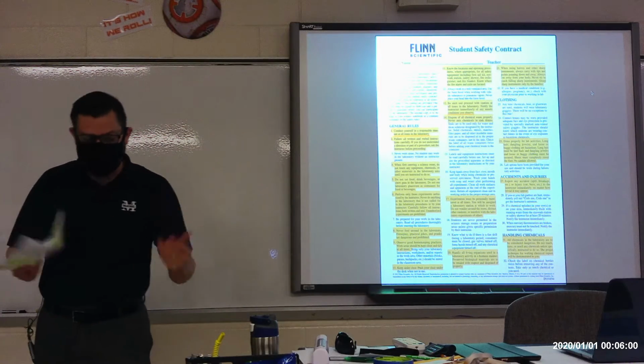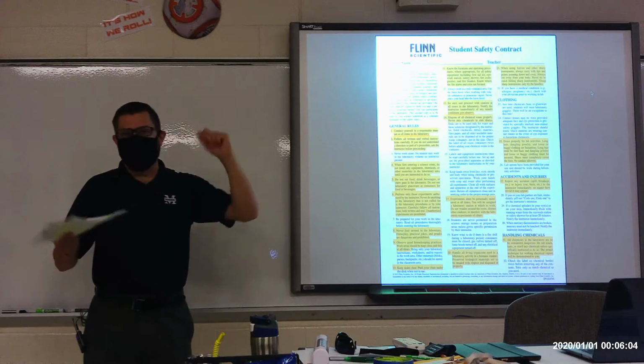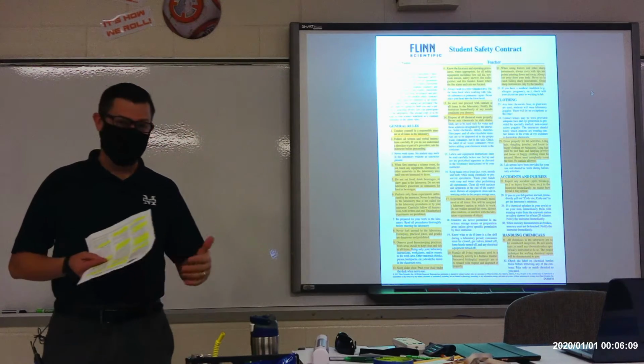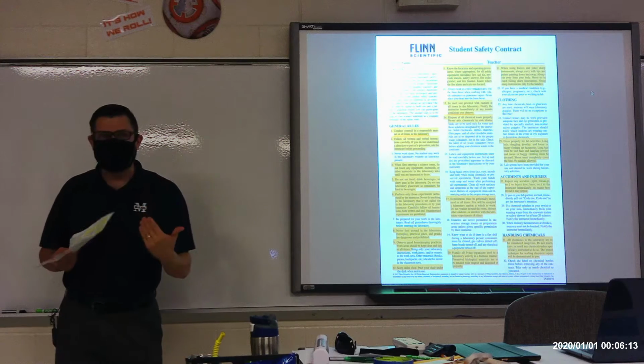So if we're looking at the direction that says, okay, take the eyedropper and put 10 drops of water, I might say, you know what, we need 20 drops of water instead to make this actually work. So you need to be paying attention to all the directions that are written down and all the directions that I'm giving you.